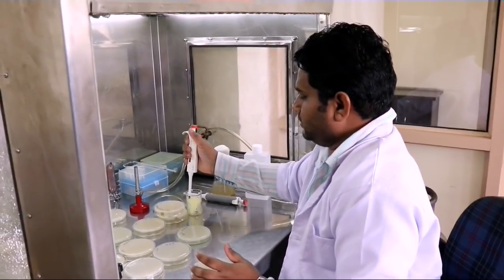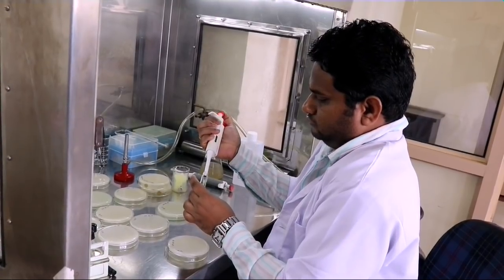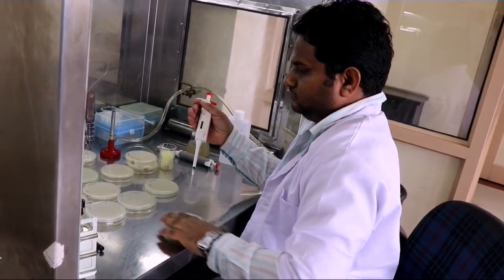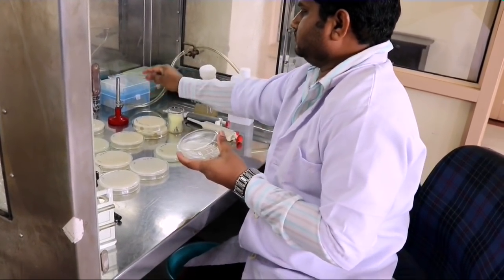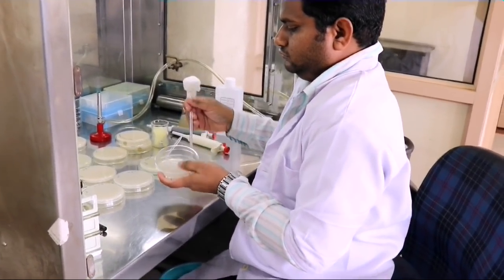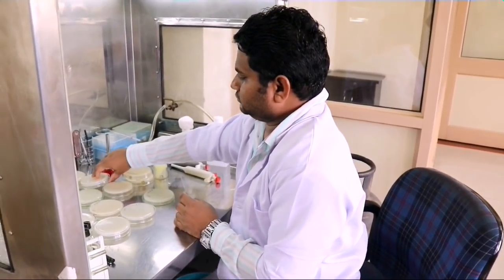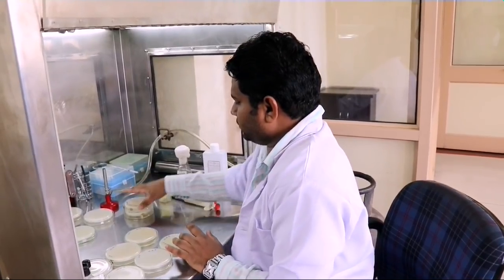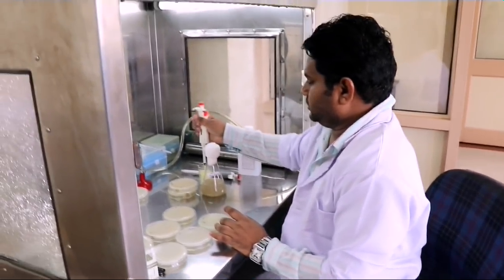In a similar manner, 10 to the power of minus 6 and minus 5 are also inoculated. Now we have completed all the dilutions. There is one more plate left — that is for the pure waste decomposer culture. We take 0.2 ml of waste decomposer and add it to that plate.